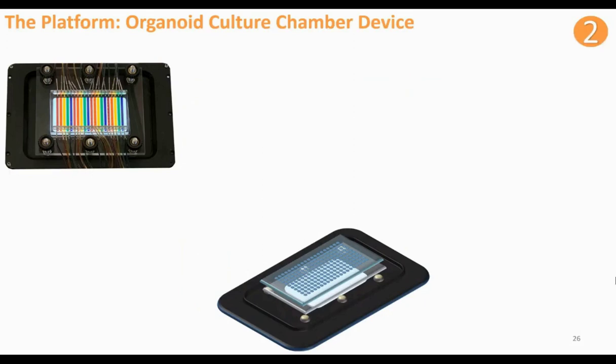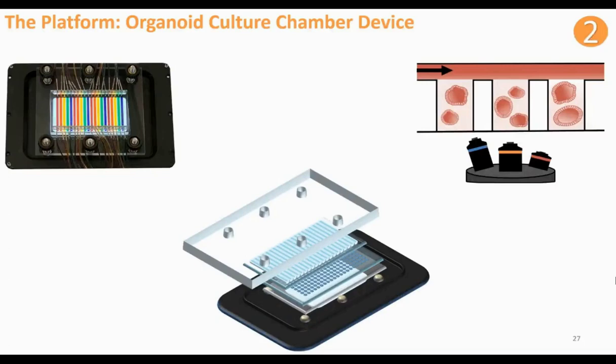Once our organoids are loaded into the chambers, a second PDMS-based channel layer rests on top of the well layer. This is reversibly bonded through a clamping-based system consisting of a clear plastic top with screws and knobs to seal the device together. Combined with the well layer, the channel layer provides fluidic channels to supply growth media during the experiment, and later on we can provide drugs or other chemical stimulants to the organoids.